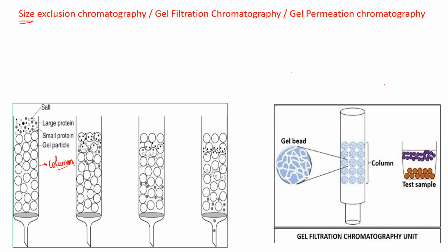Okay, now when you're packing the beads in the column, see, for example, this particular column I'm talking about, do you see some gaps in the column? Are there any gaps? So if I color it, say with green, what are they? Are they the gaps between the beads?